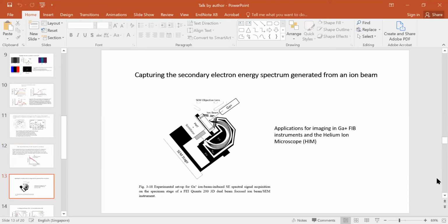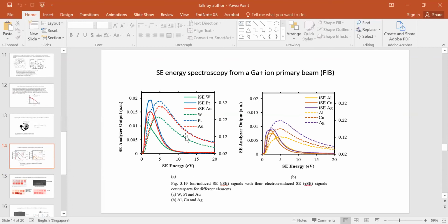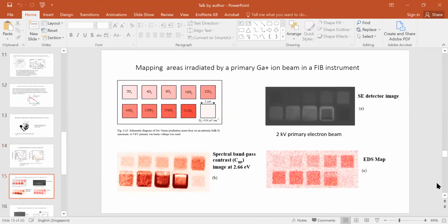Just to cover a few topics very fast at the end, we've also captured the secondary electron energy spectrum of a gallium ion beam inside a dual FIB and compared the energy spectra of the secondary electrons with that produced by an electron beam inside the dual beam. And you can see how much narrower they are compared to an electron beam. That's characteristic of, has information about the ion beam. It's also very interesting that you can map the areas that have been irradiated by a gallium ion beam with an electron beam afterwards using SE energy spectroscopy.